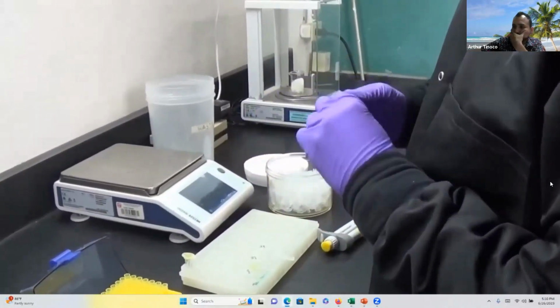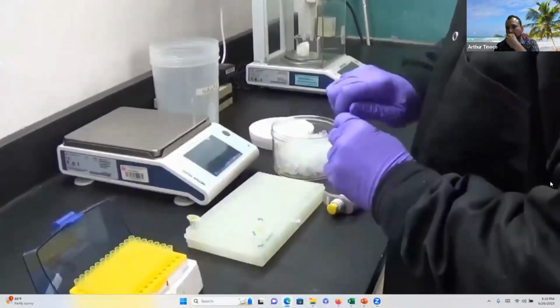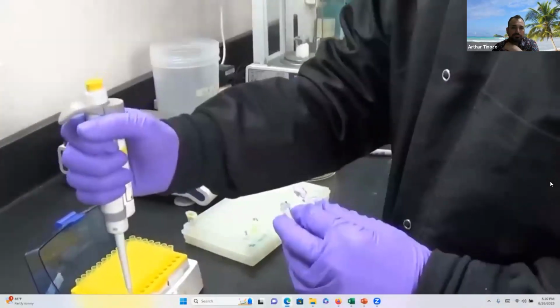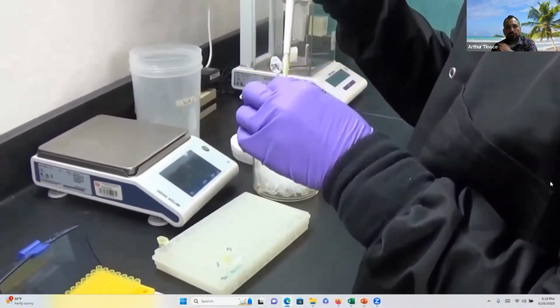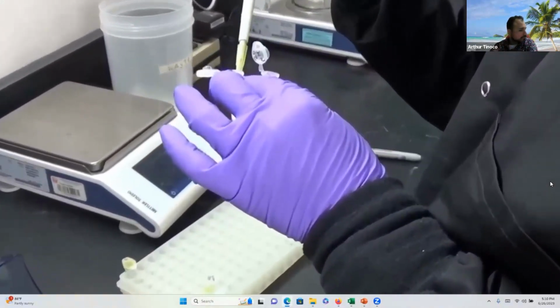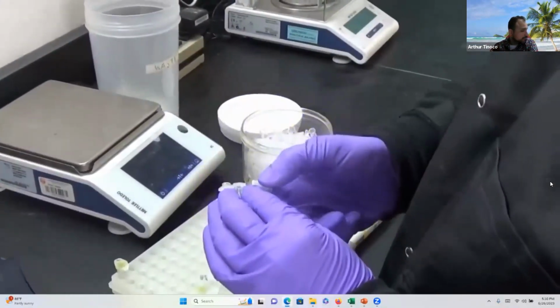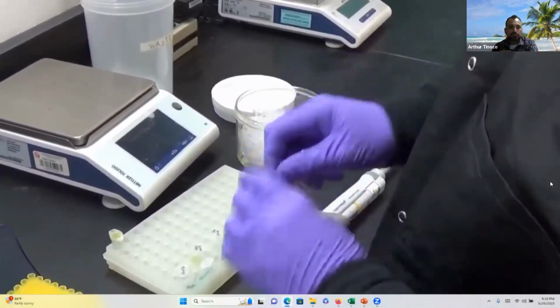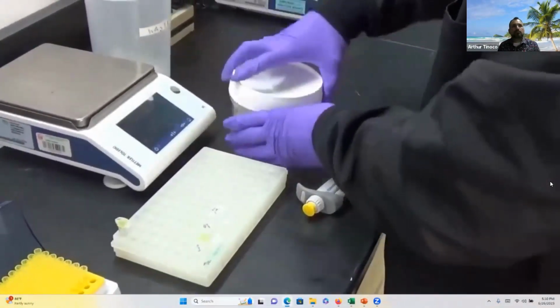Into these epis, I will pipette 5 microliters of the 200 micromolar compound, and in the other epi, 5 microliters of the 20 micromolar compound. In effect, I dilute both samples by half. So I will have a 10 micromolar sample and a 100 micromolar sample. In total, I will have 10 microliters each, which will be plenty of sample to work with.